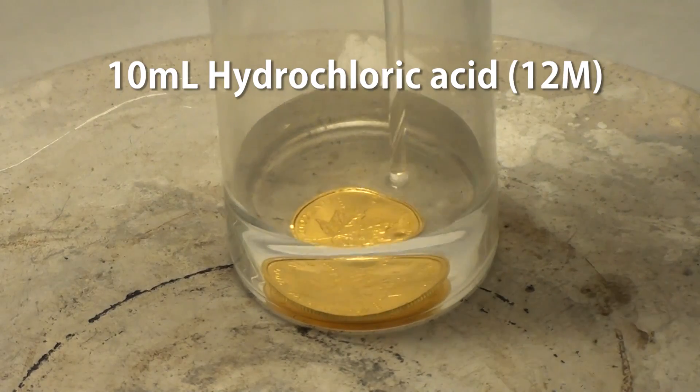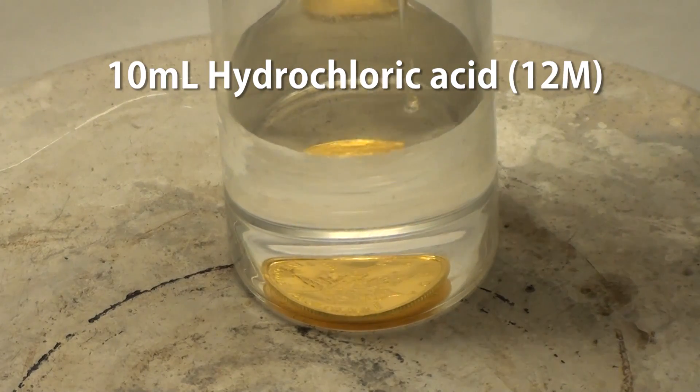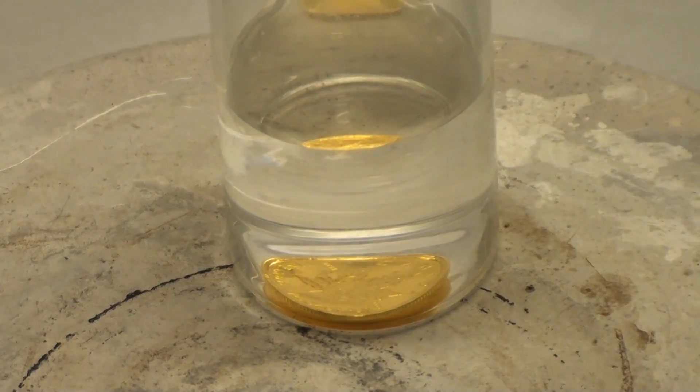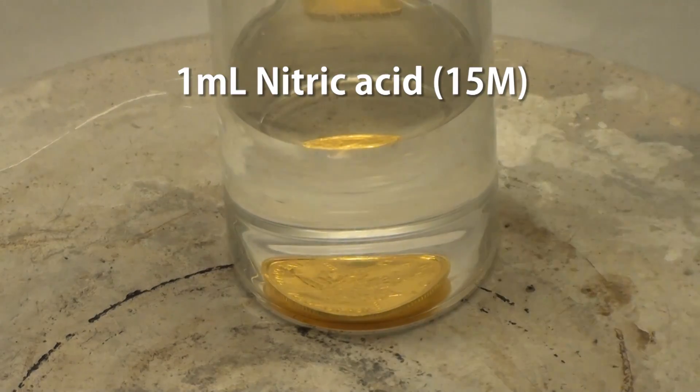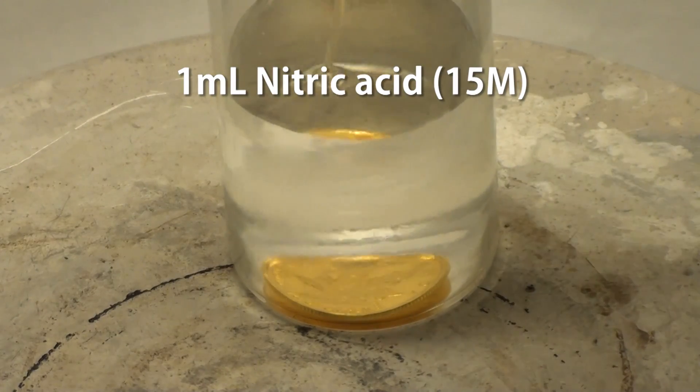Now we add 10 mL of concentrated 12 molar hydrochloric acid. By itself the acid does not react with gold, so we add another 1 mL of concentrated 15 molar nitric acid.